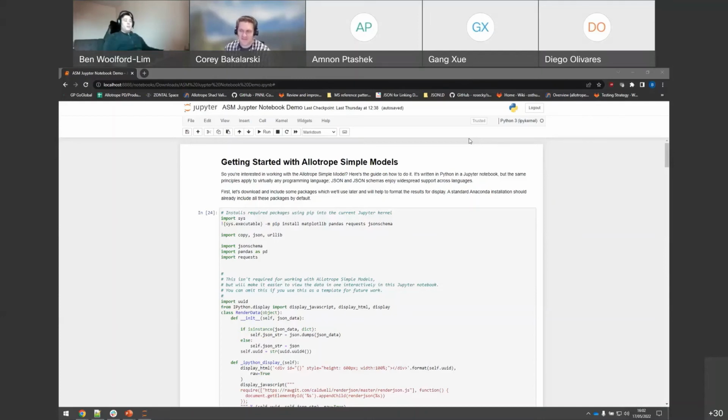Great. Getting the ASM files actually refers back to Amnon's talk earlier about looking into the GitLab repository. The GitLab repositories have all of our models, which include the ASMs now. If you're looking for an instance file specifically, those are stored under the test folder.